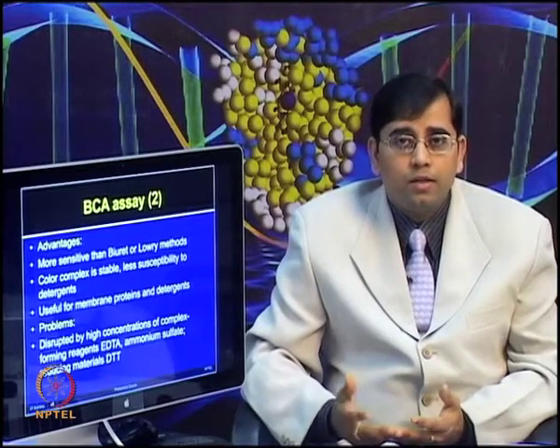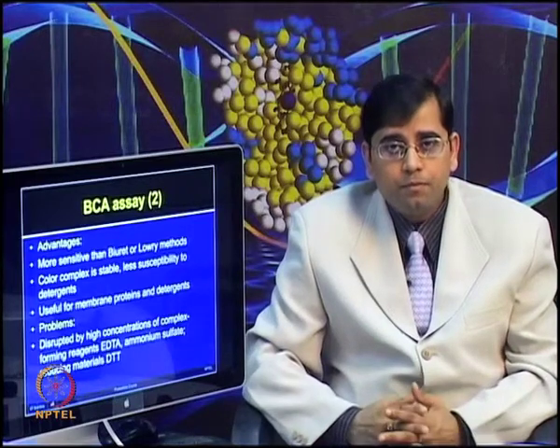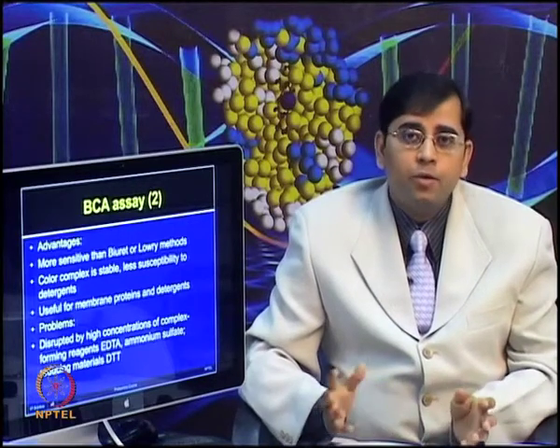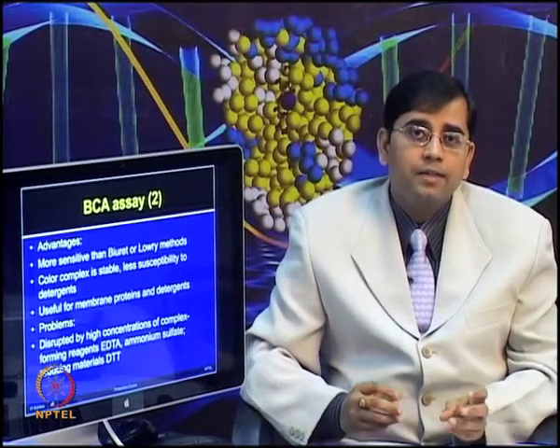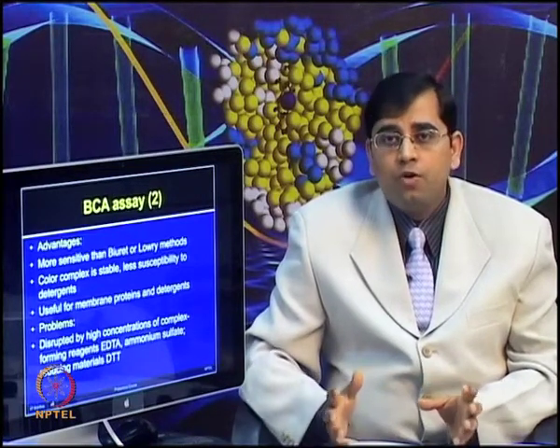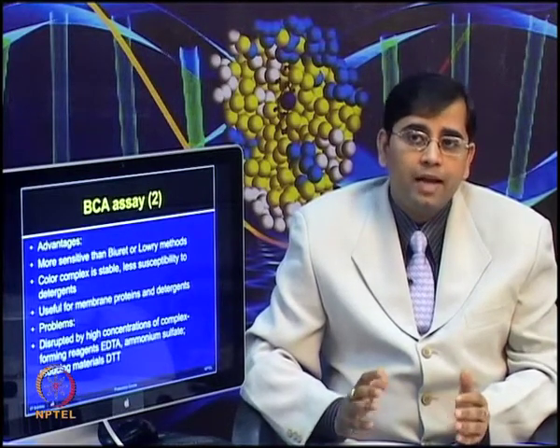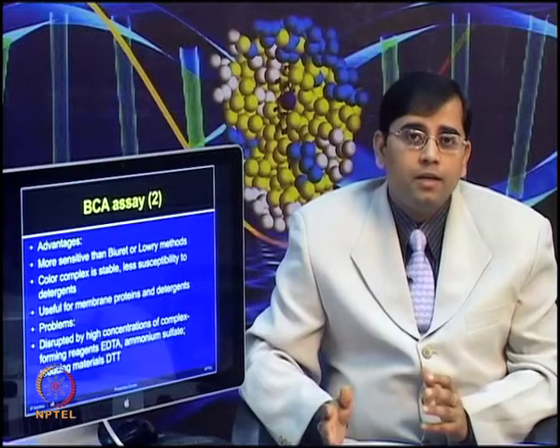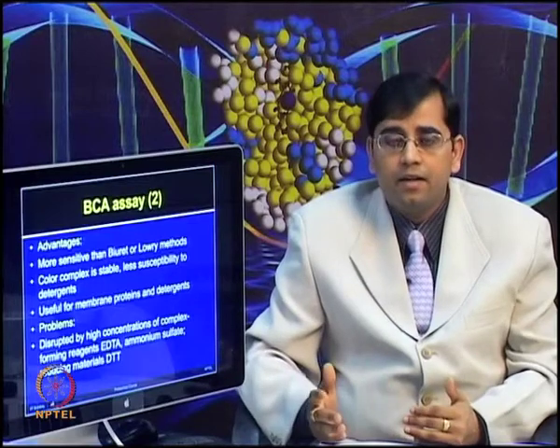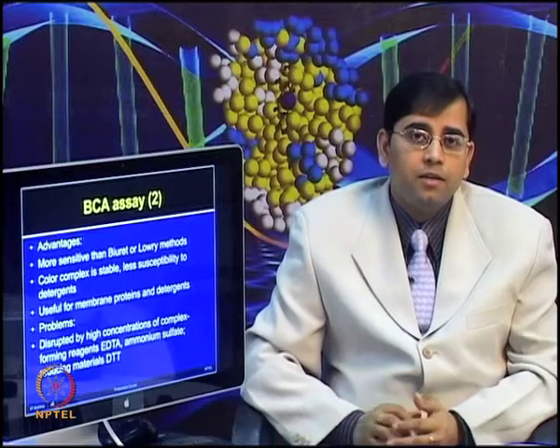Now, if you are starting with an equal amount of protein, 100 microgram for example, but your quantification has some artifacts, because you have some interfering components which are giving a false reading, your quantification will not be accurate, and rather than measuring only 100 microgram from the controls and the treatments, you are actually measuring 90 versus 100 or 100 versus 110. So, there will be some artifacts if you do not start with the exact protein amount.